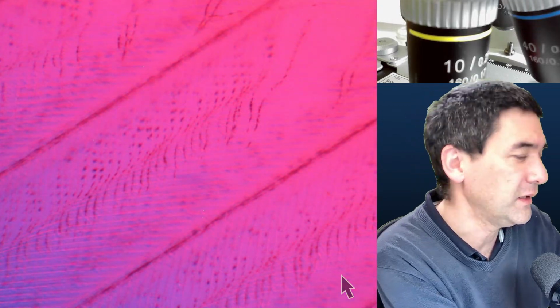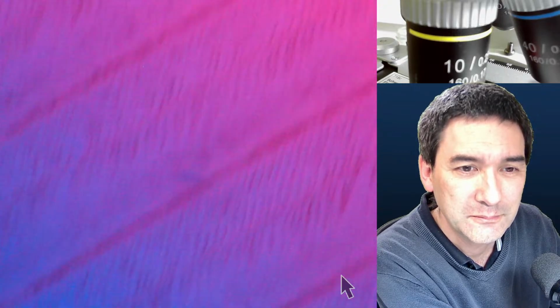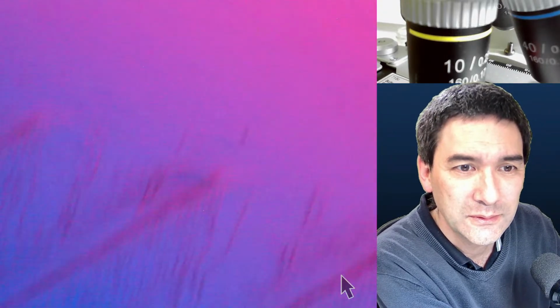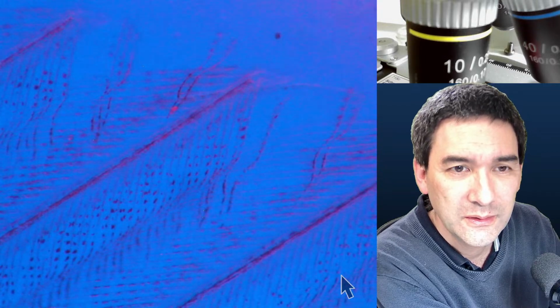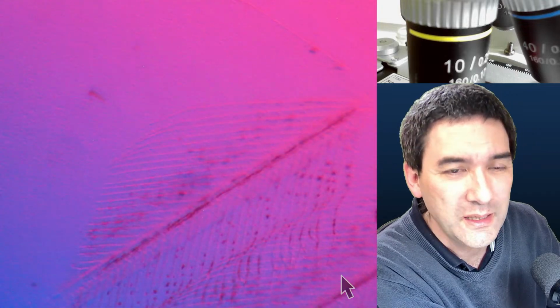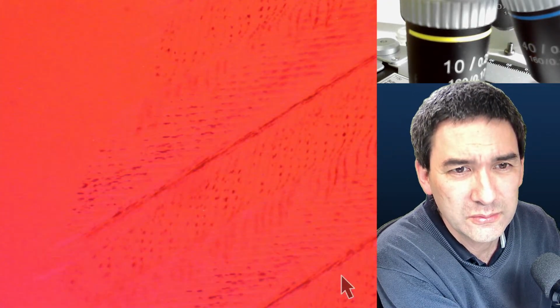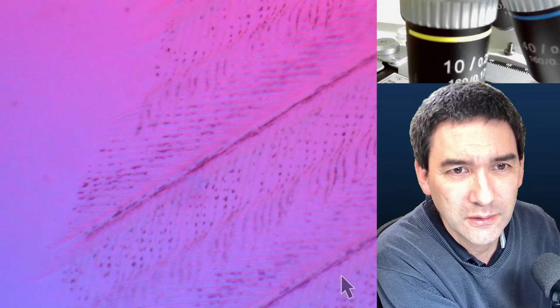Again, the contrast is much better when looking through it compared to what we see here. No, this is not so, not quite as. So you see that again, not every specimen is entirely suitable. Let me try this one over here because it has this regular pattern. I'm going to try now the one which has red and yellow on the side. Maybe this. No. Nope. I think that illustrates that not all specimens are equally suitable, right?